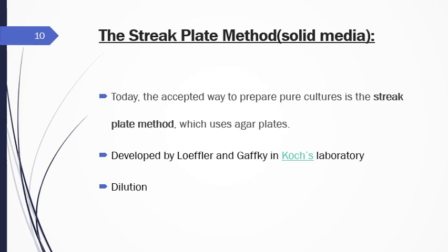Streaking is a rapid and ideally simple process of isolation by dilution. The technique is done by diluting a comparatively large concentration of bacteria to a smaller concentration. The decrease of bacteria should show that colonies are sufficiently spread apart to affect the separation of different types of microbes. Streaking is done using a sterile tool such as a cotton swab or, commonly, an inoculating loop. Aseptic techniques are used to maintain microbiological cultures and to prevent contamination of the growth medium.